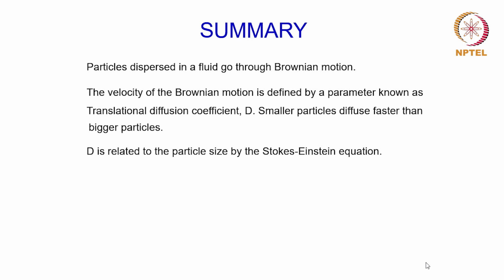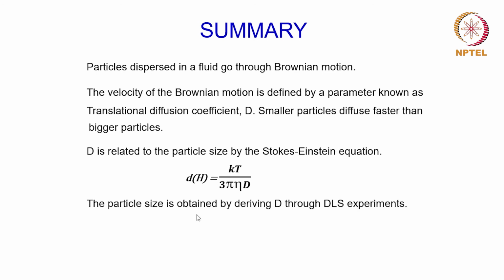And this translational diffusion coefficient D is related to the particle size by the Stokes-Einstein equation, which is as follows. Here all the parameters except this D are known. So if we can derive this D, the particle size dH can be obtained using this equation. So this is what is being measured by the DLS experiments.